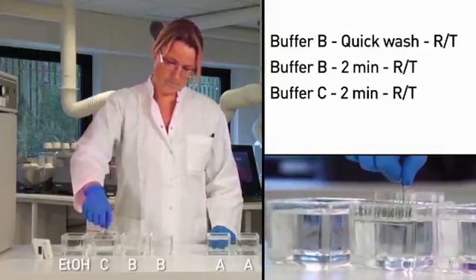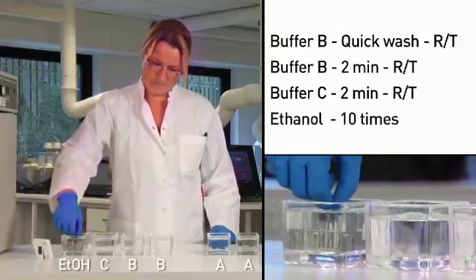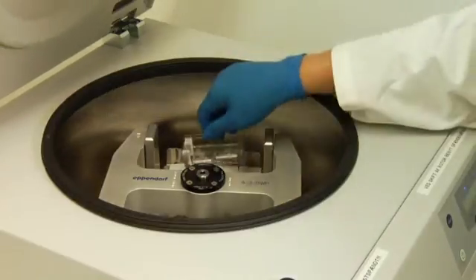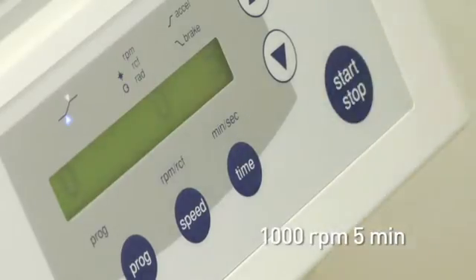Slowly lift the slide to let the buffer drain, then place it in ethanol. Spin the slide to remove any residual solution. Immediately following this step, the slides should be scanned.